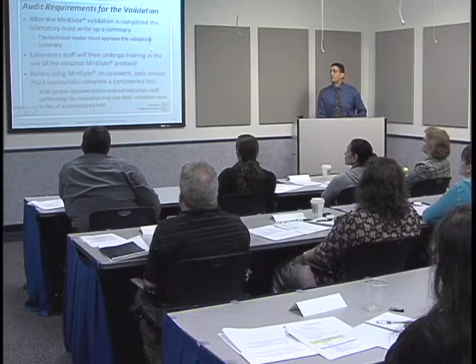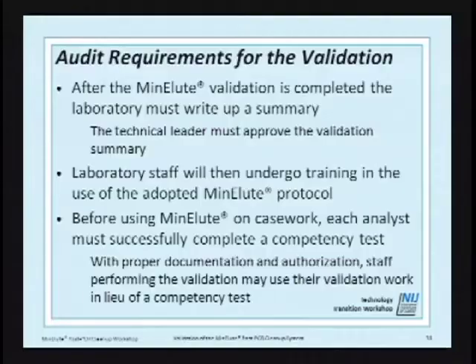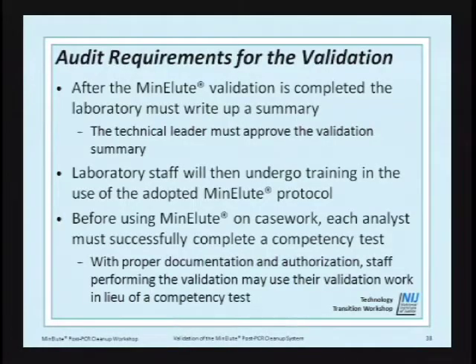Okay, for the audit requirements, after the MinElute validation is completed, the laboratory must write up a summary. The technical leader must approve the validation summary. The laboratory staff will then undergo training in the use of the adopted MinElute protocol. Before using MinElute in casework, each analyst must successfully complete a competency test. With proper documentation authorization, staff performing the validation may use their validation work in lieu of a competency test.